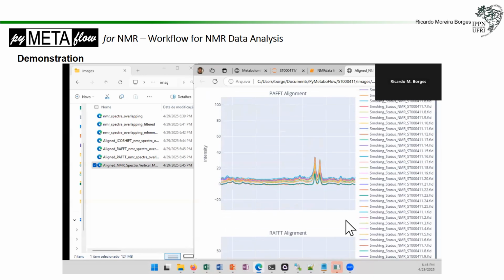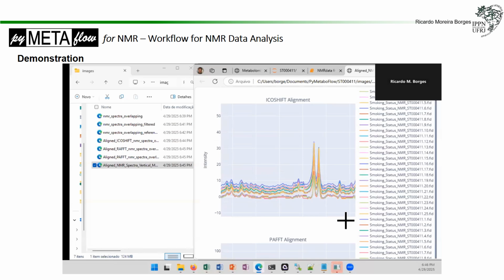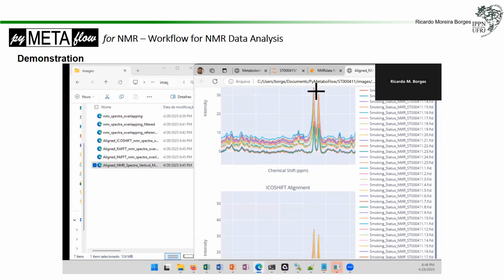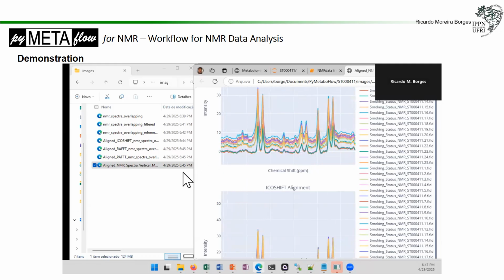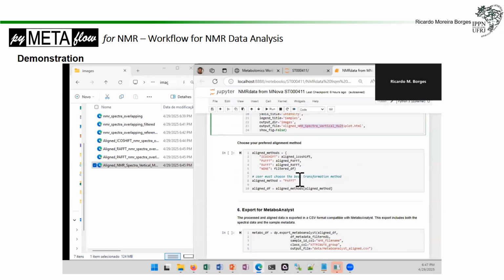Well, we don't want to decide anything right now, but in a series analysis, you will check everything, right? So this is a good example that you need to check for the alignment, right? Okay. So next step, you check your aligning method and you choose one.